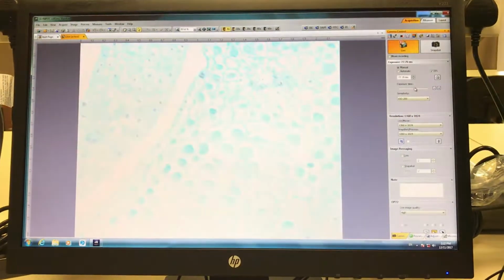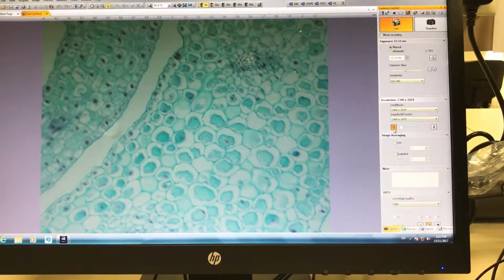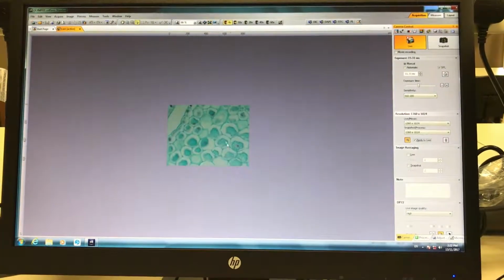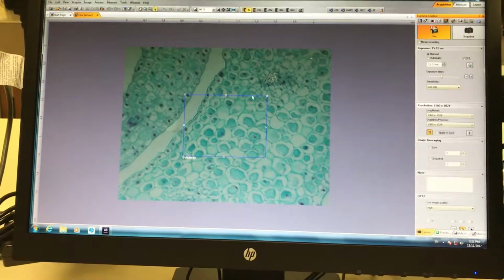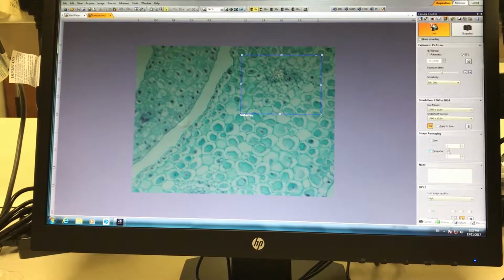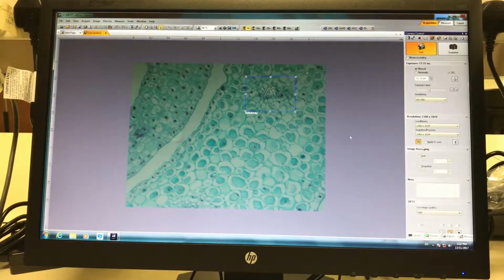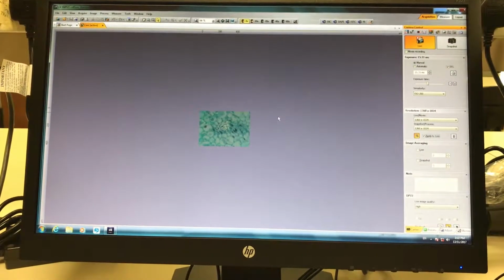And then we have something like crop. When you activate it, you will see this blue box. Okay, so you can say apply to live, then only that particular region will be captured. So that is just like a crop feature. Let's say instead of taking the full frame, you're only interested in this particular part, then you can adjust the size, you can move it around. So when you click snapshot, then only this part will be acquired.